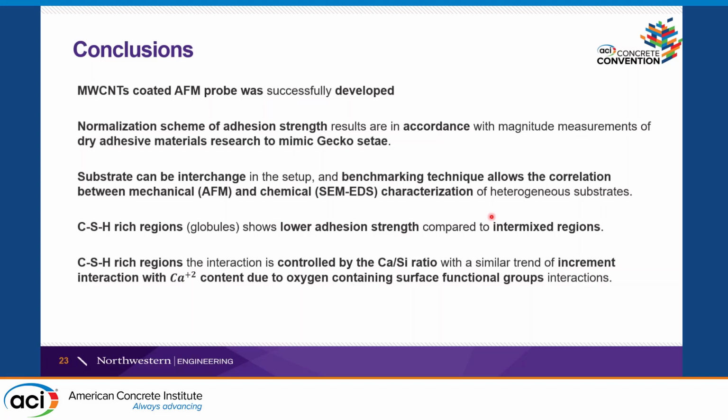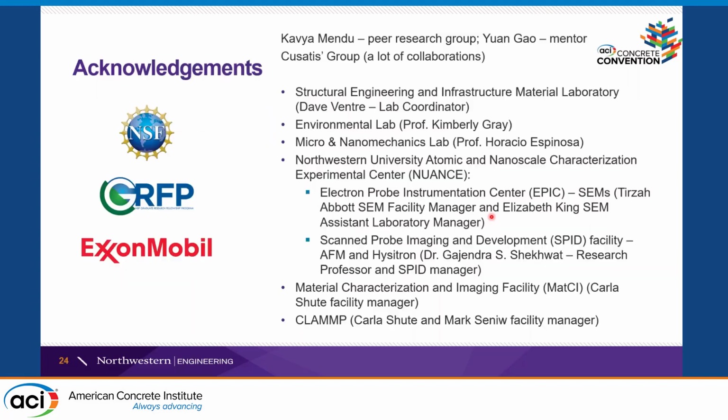Then the benchmarking technique allows the correlation between the mechanical AFM measurements and the chemical SEM-EDS. And the calcium concentration of the CSH will be controlling the interaction of the multi-wall carbon nanotubes, or the interface between the multi-wall carbon nanotubes and the different cementitious systems.